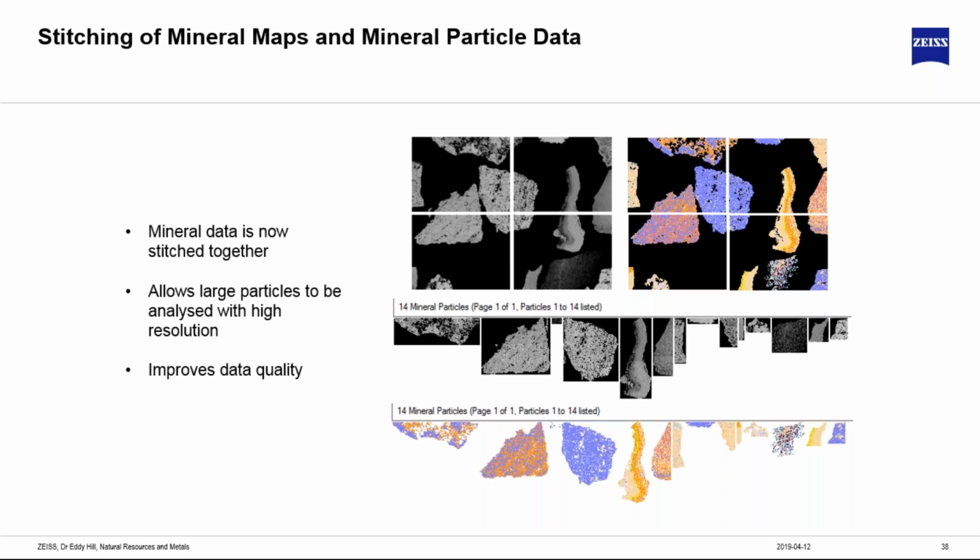This allows larger particles to be analyzed with high resolution and obviously improves data quality because we're not looking at fractions of a particle in our statistics, we're looking at actual particles themselves.